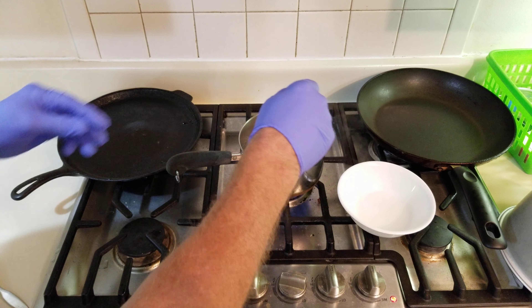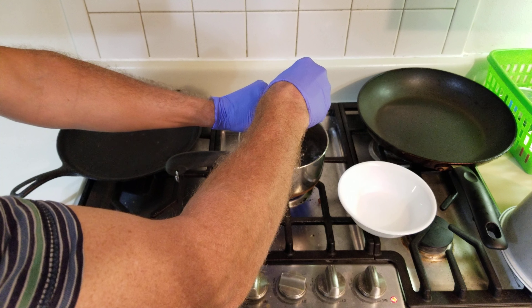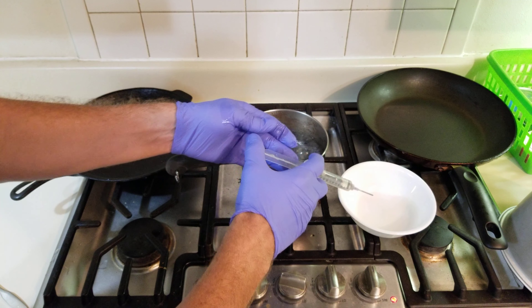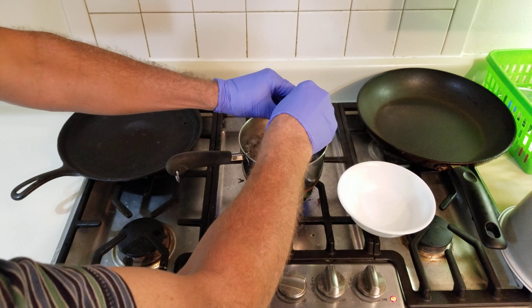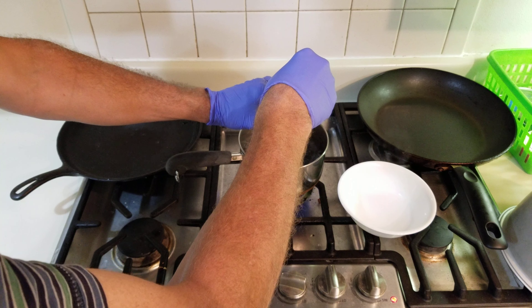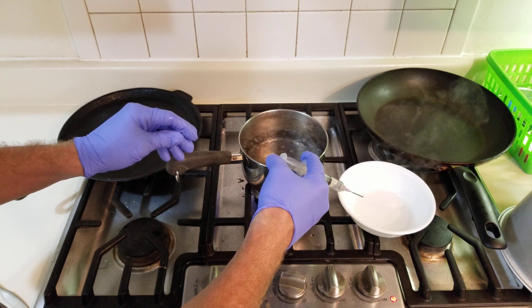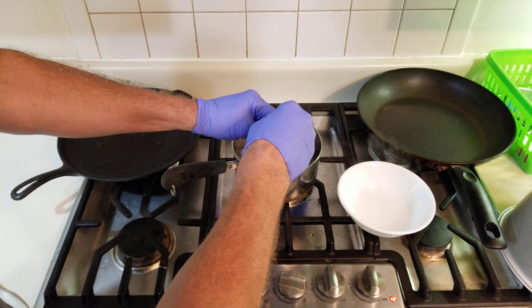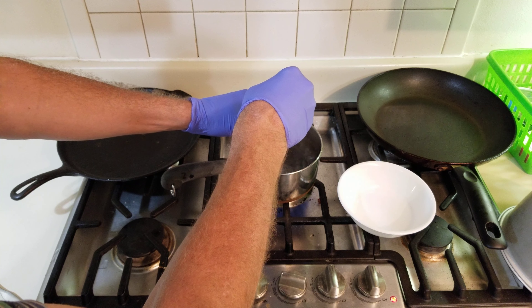Do this about five times. If you go down too deep, or if you don't go down deep enough, you'll get a lot of air pockets.